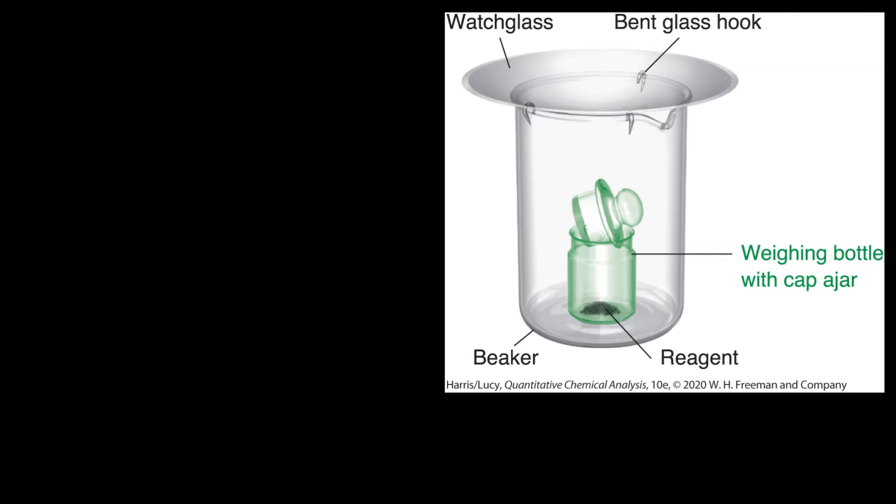Here's the weighing bottle with the substance we want to dry, and here's the lid. We can place a watch glass over the surface of the beaker to prevent any dust from coming in, and we can place it in an oven.